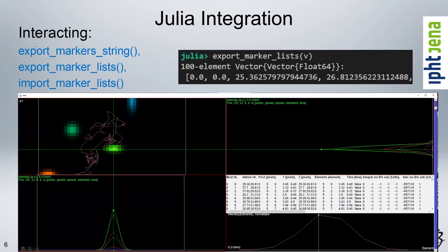Finally, how can you interact with the viewer? The viewer also supports markers and marker lists that you can use for tagging certain particles, but also for tracking. As you see in this example here, you can import and export such marker lists as a standard Julia type — a vector of vectors — something like this.